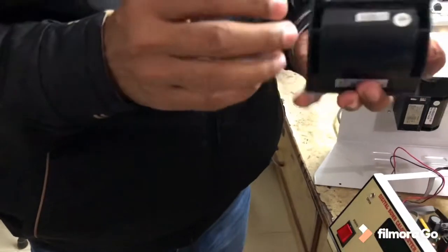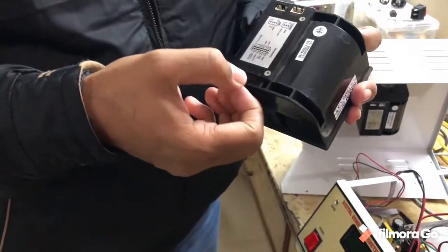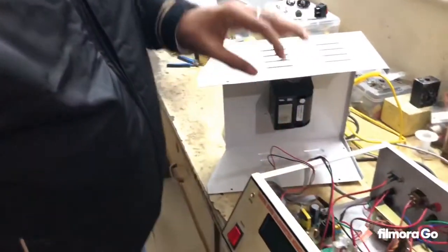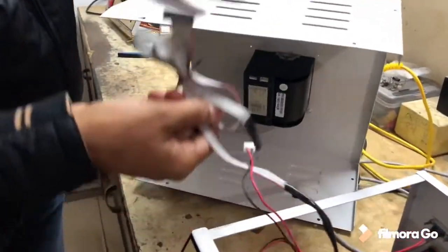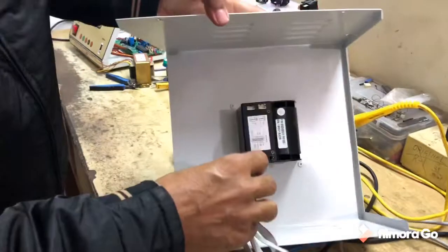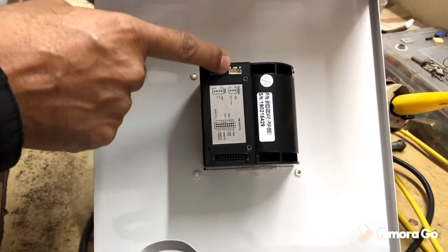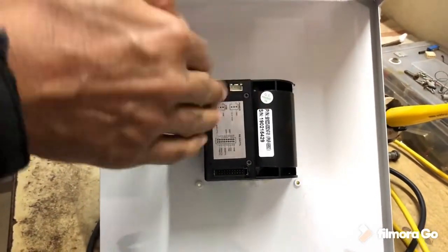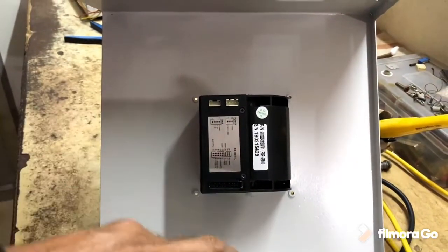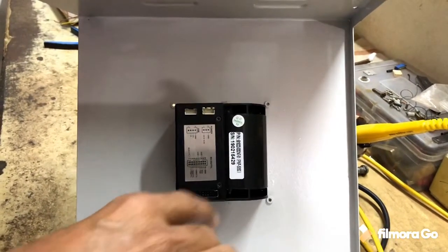There are only 2 connectors. One is the power connector. The other is the signal connector, which is a 20-pin connector. The main point to remember is that in this 20-pin connector, you will see there is a red wire. That red wire should come on this side only, not the other side. This connector can only go in one direction — in the reverse direction it cannot be inserted. But here it can be connected in reverse position also, so always keep the red wire on top. Thank you.